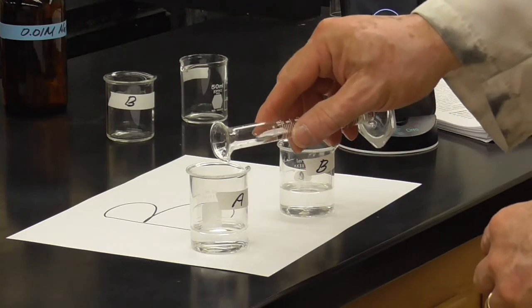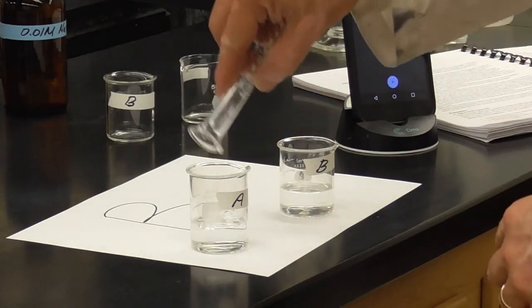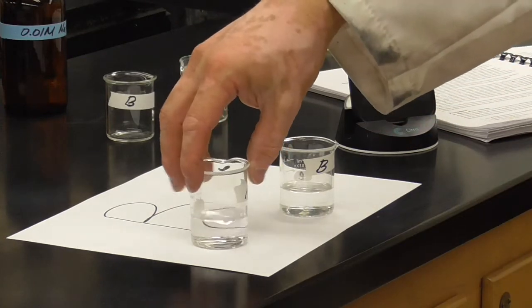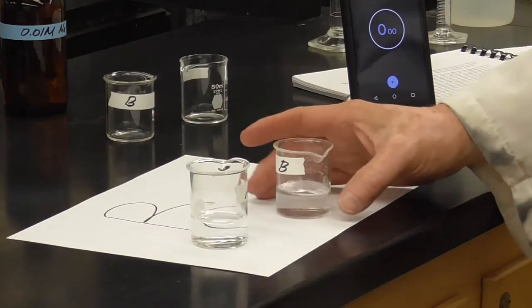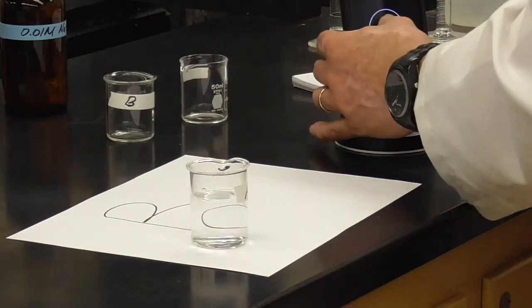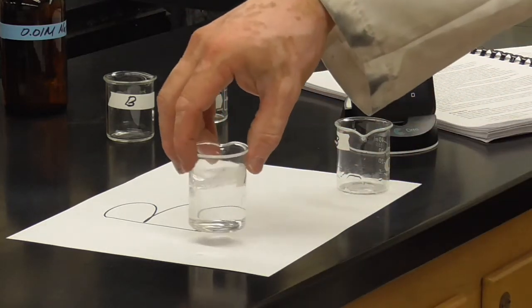Pour that into A. Okay, this is a reset. We'll add B. Start, swirl that together.